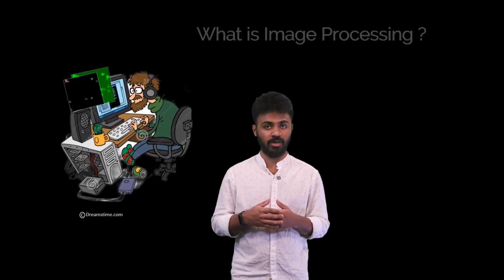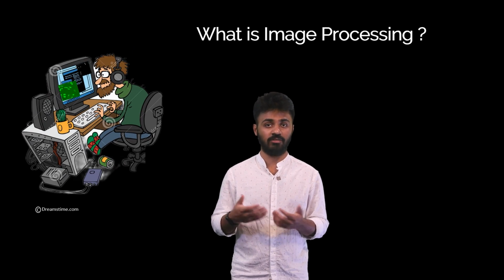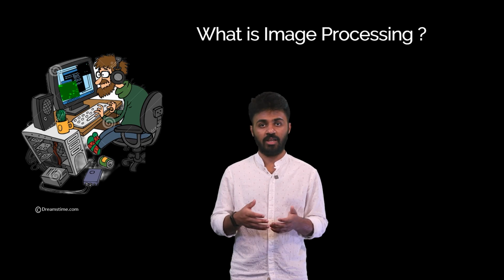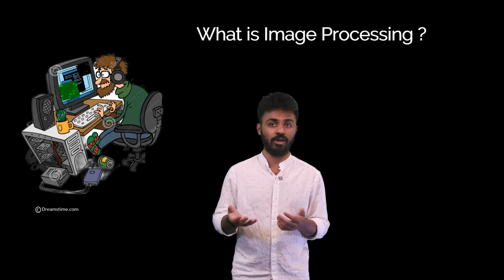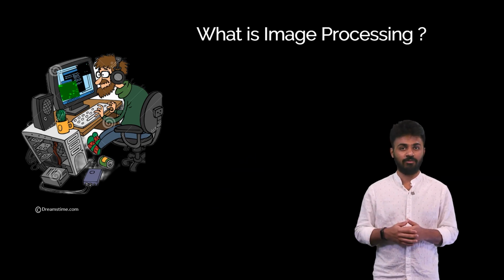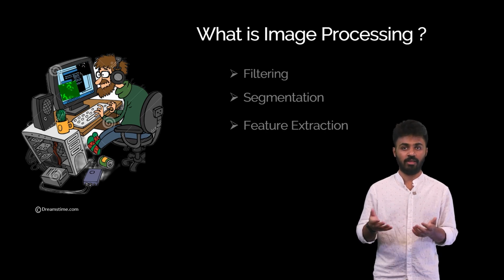When we capture an image of a biological sample, it's often too complex to understand at first glance. That's where image processing comes in. It's a set of techniques and algorithms that allow us to analyze and extract meaningful information from images. There are several types of processing techniques that we use in biology, including filtering, segmentation, and feature extraction.